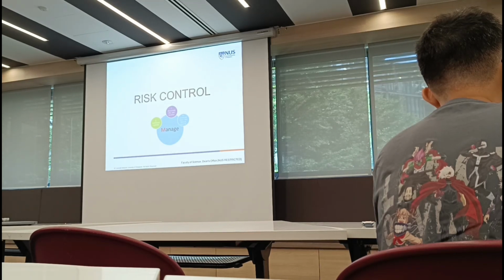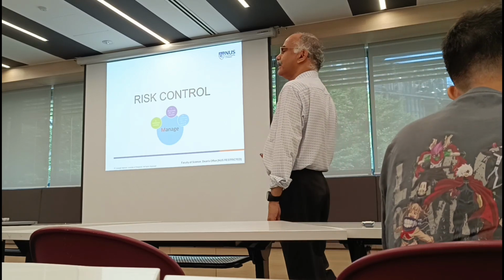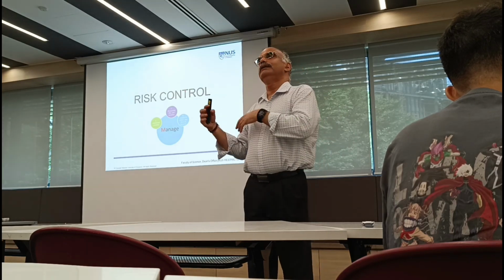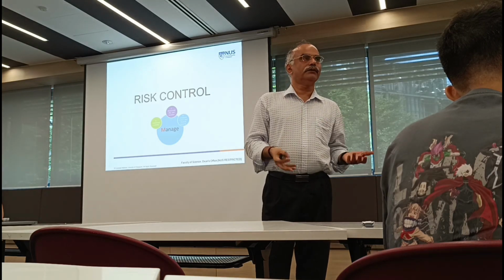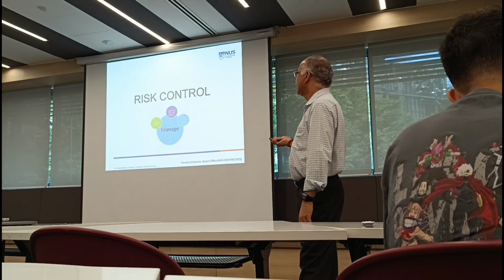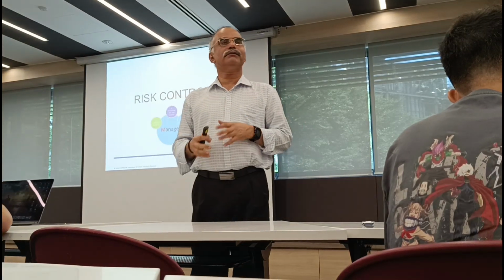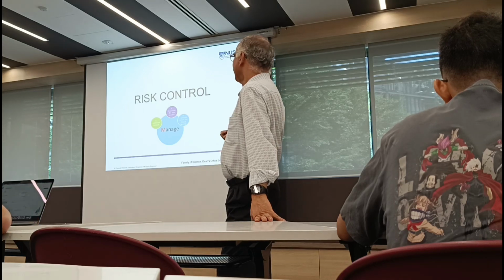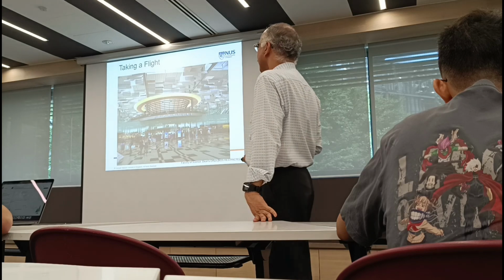Risk control. So we need to manage the risk where we look at additional controls. If numbers go 3 or anything above, then you need to have some additional controls in place so that it doesn't get out of your hand, right? And then we say responsibility or compliance, who will help you? Because you yourself may not be able to do it. Somebody needs to be even included in the responsibility. And then communication and record keeping. All those things have to be written down.